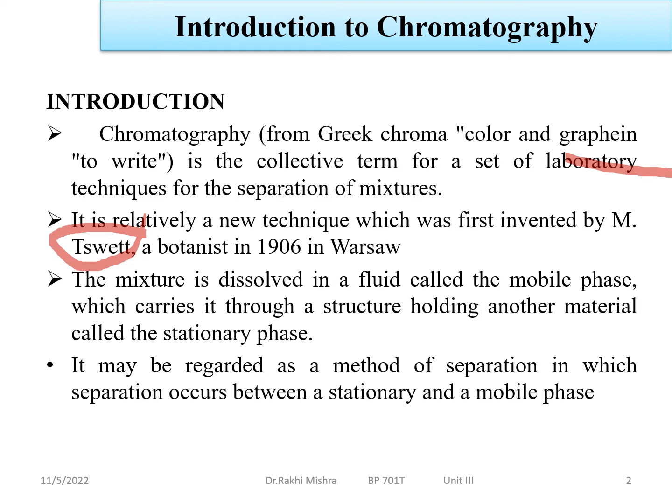If you are doing research, you can't use expensive techniques like spectroscopy or X-ray diffraction every minute or every hour. At that time, you can use chromatography. It is a collective term for a set of commonly used techniques.